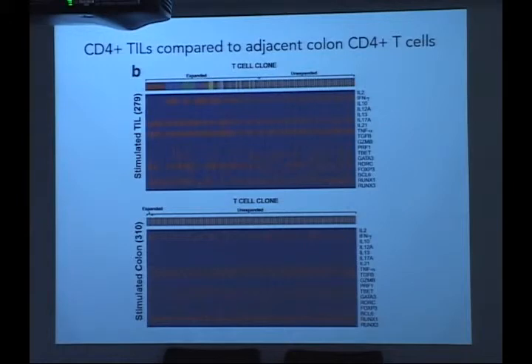We get a lot of information, obviously. So this is basically the tumor-infiltrating lymphocytes. And a few things that we can see is clearly that there's a lot of clonal expansion going on. Each color bar represents 1 TCR. Whereas in the colon sample adjacent to the tumor, really strikingly, there are only 4 T cells in the whole set that are expanded, and they're only expanded once. In other words, you find that TCR twice in the sample rather than once. But here you get massive amounts of clonal expansion, with certain T cells accounting for about 10% of the whole population.